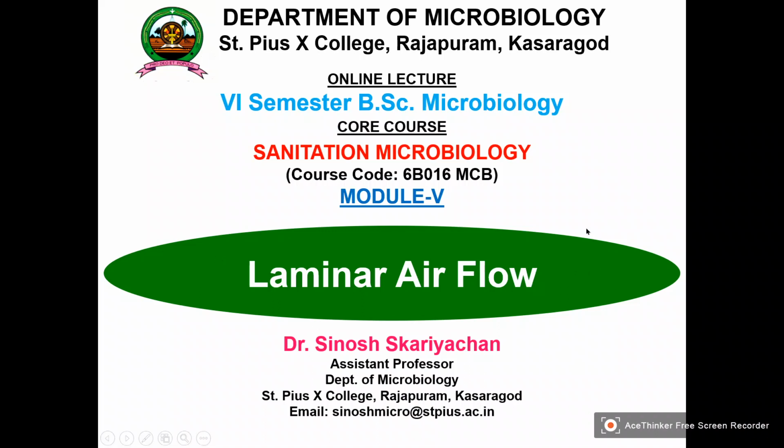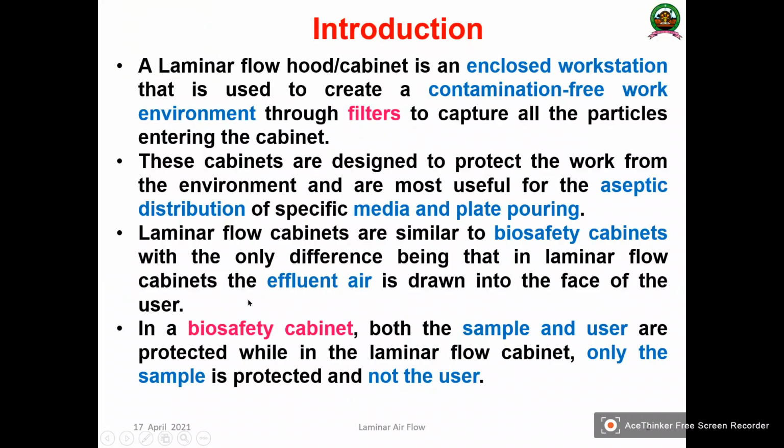contaminant-free environment. And that is the next topic mentioned in the syllabus, module number 5 of Sanitation Microbiology, that is laminar airflow. Laminar airflow, or simply known as laminar flow hood or cabinet, is an enclosed workstation that is used to create a contamination-free work environment through filters to capture all the particles entering into the cabinet.